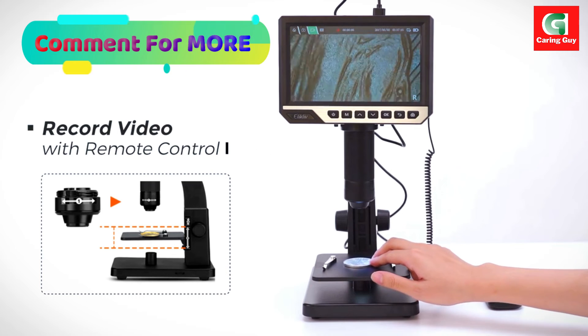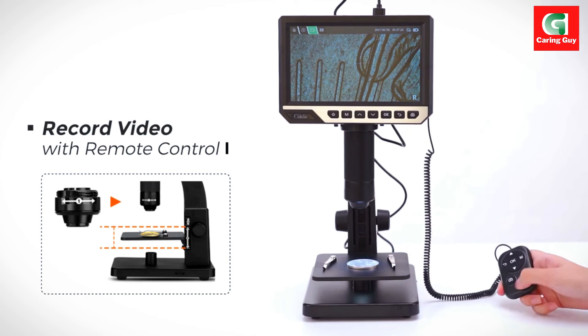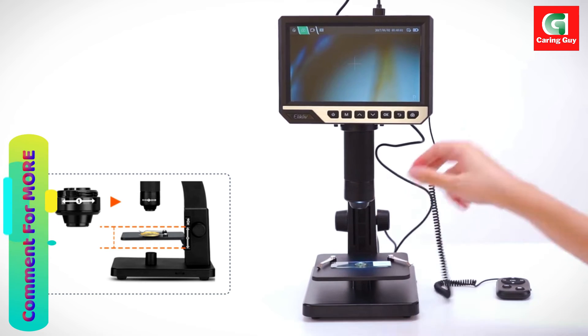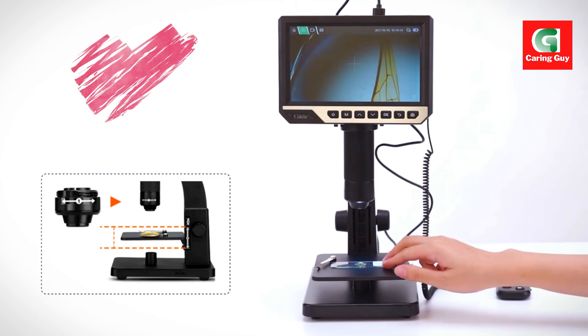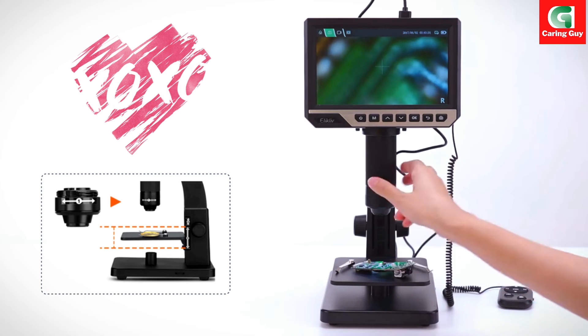The microscope's screen design is rotatable up to 90 degrees, enhancing convenience for users from different angles. This adjustable feature adds flexibility and user-friendliness, catering to a diverse audience.